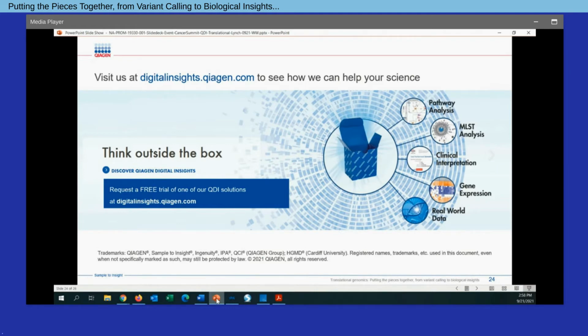Does Ingenuity generate PCA plots? It does not. So really, Ingenuity Pathway Analysis is built for interpretation. So if you wanted to do a principal component analysis, there are abilities to do that, specifically in the context of gene expression data within CLC Genomics Workbench.